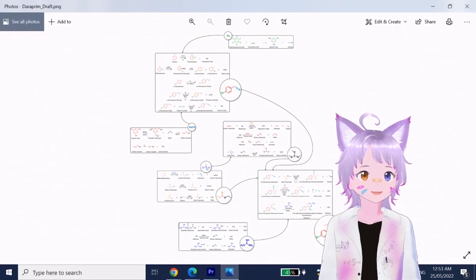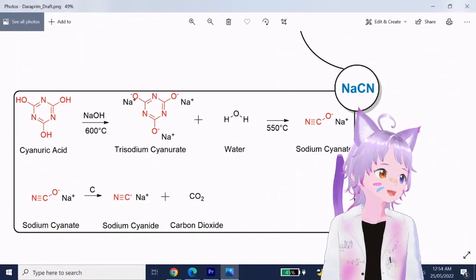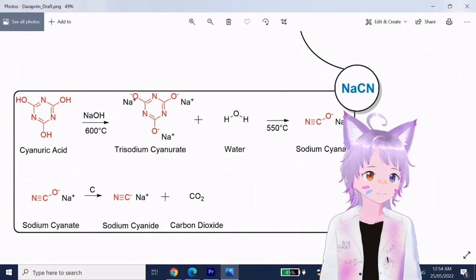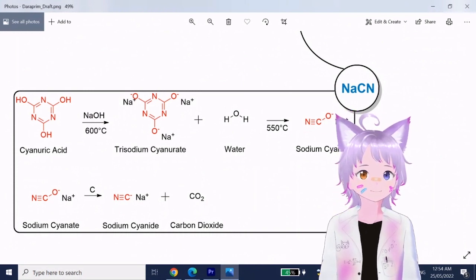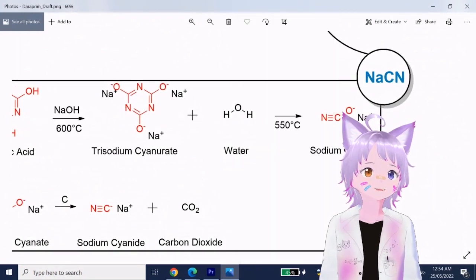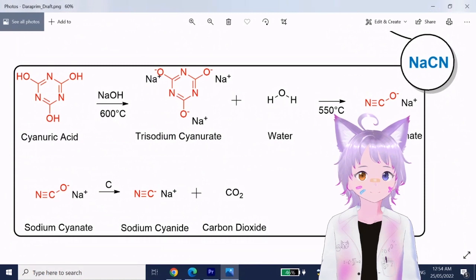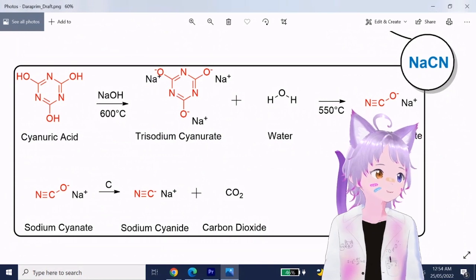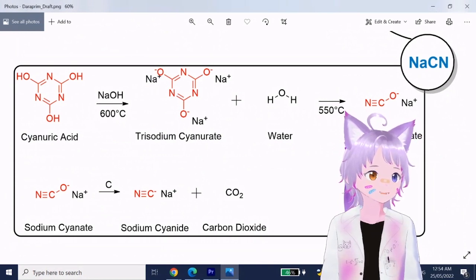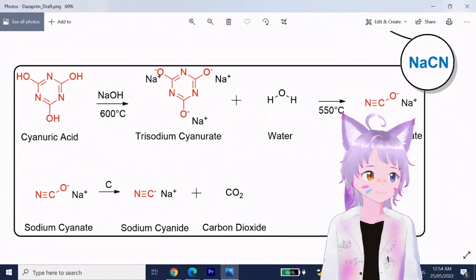And I was going to talk about his cyanide synthesis. You remember Nurdrage said that the cyanide he got from the process of converting sodium cyanate into cyanide at high temperature failed because of sodium carbonate and bicarbonate impurities, and the only way he got it to work was by creating Prussian blue, purifying that, and then cooking that down, which is a pain. Because you have to really make sure it's free from any other stuff. I mean, there is another way to do this, but let's not.